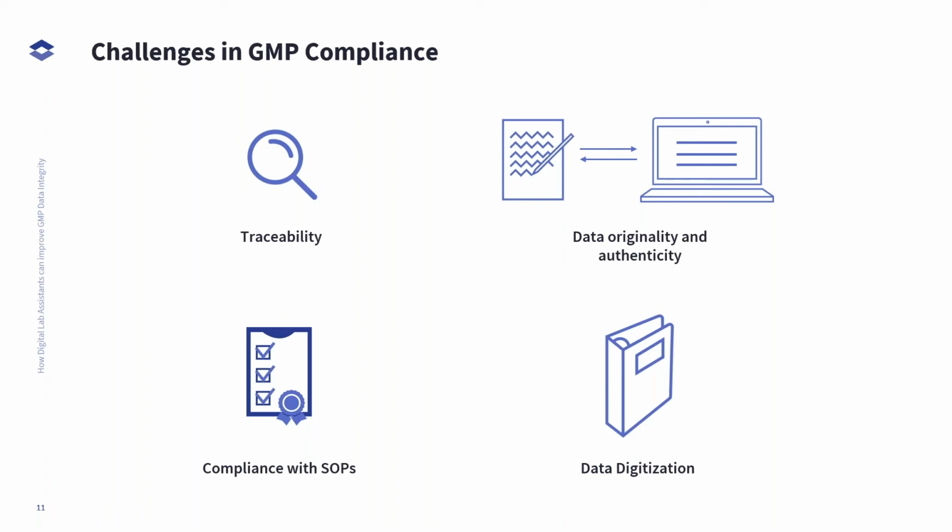But when they start going to the laboratory records, everything was going more in paper because we still haven't implemented a full laboratory system. And then you have the forms, the lab books, the different areas of the laboratory, as you were also saying at the beginning, the balances not being really at the same place where they take the sample, and then they start doubting how traceable is your data and how good are you really documenting.